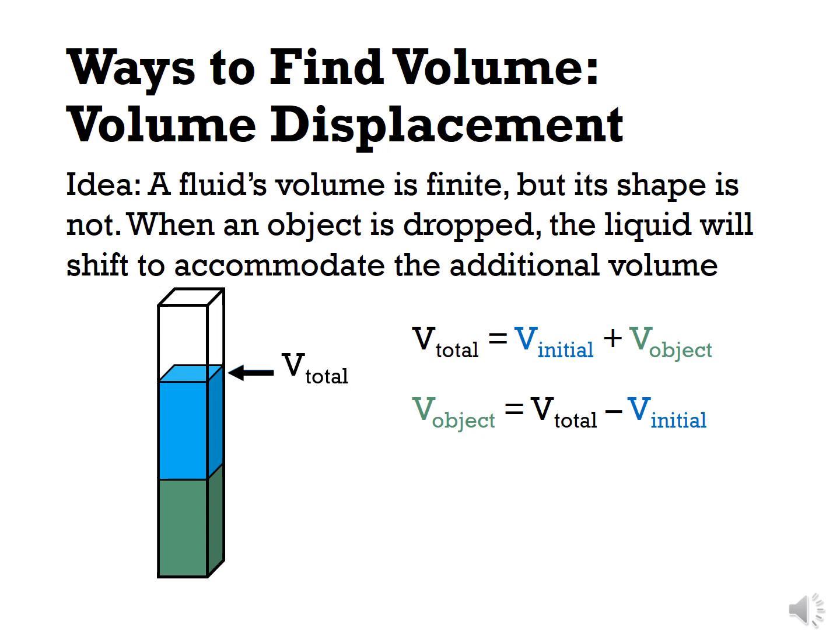What kind of glassware is appropriate for taking these measurements? It is our good friend, the graduated cylinder.